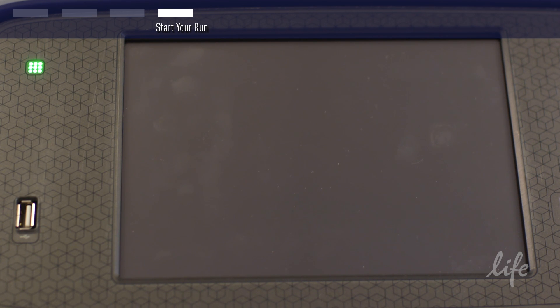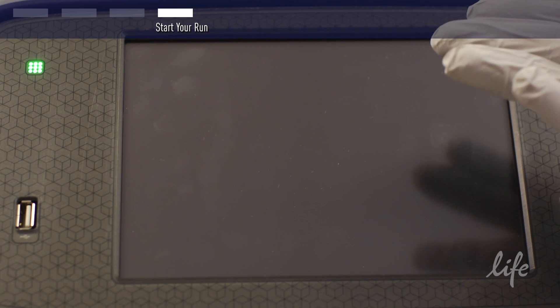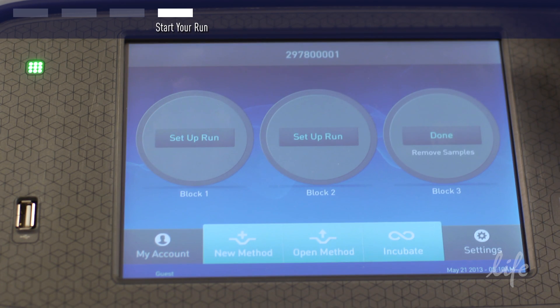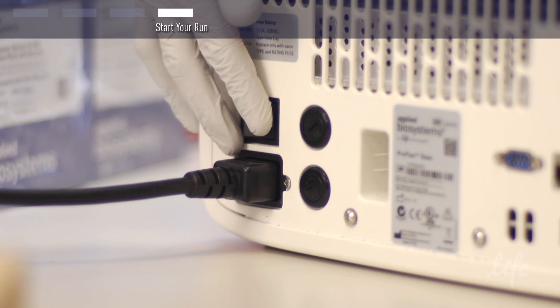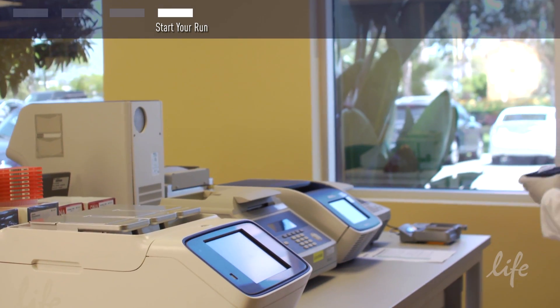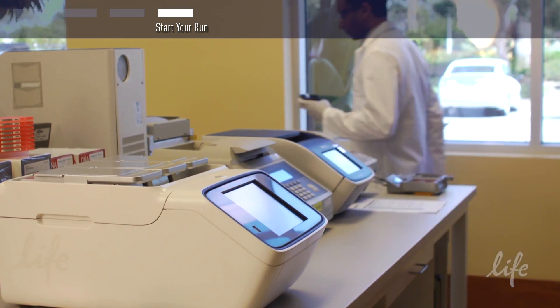If the instrument is inactive for a set period of time, it will go into sleep mode. It can easily be activated again by pressing the screen. The instrument uses minimal power during sleep mode. However, you can also shut down the unit with the switch on the back. Make certain to shut down your block and turn off the ProFlex PCR system when not in use.